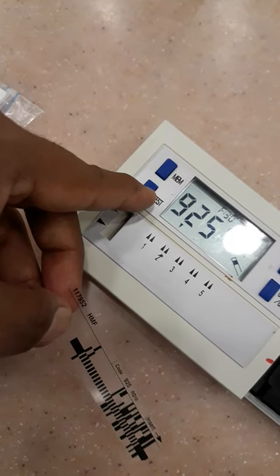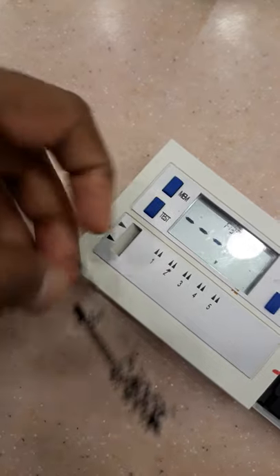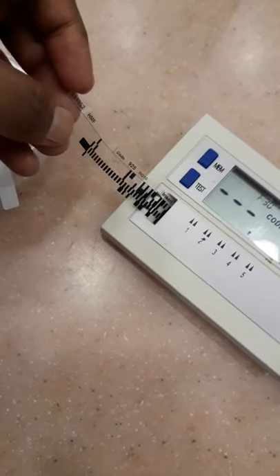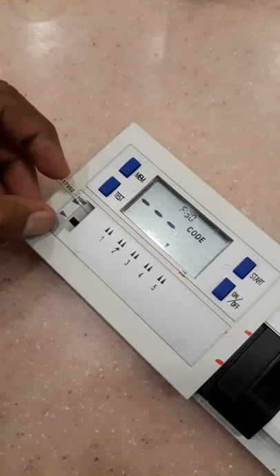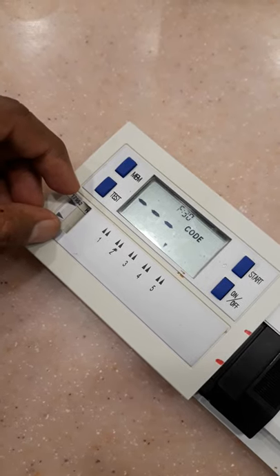First, we need to press the test button where we need to save the calibration value — suppose here at slot 4. Then I will insert the HMF barcode into the arcuflux.